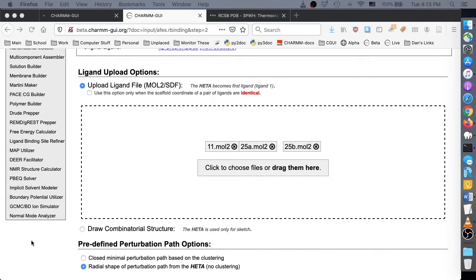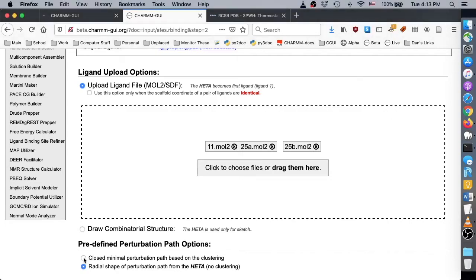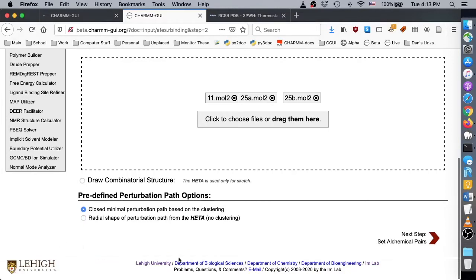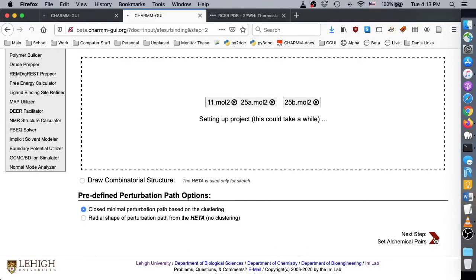The ligand ZMA will not be used for the relative free energy calculation, so you should not use a radial perturbation path, as this option uses ligand 1 as the central ligand. Instead, choose the minimal perturbation path, and click next to view the ligand pair options.